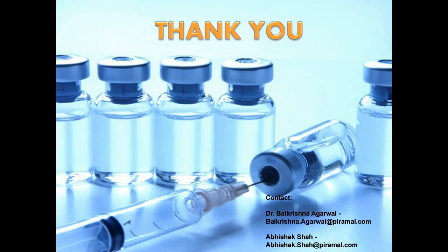There are compounds which contain nitrosamine groups in their structures. There are compounds which contain polyaromatic hydrocarbons. These compounds can be considered highly concerned extractables.